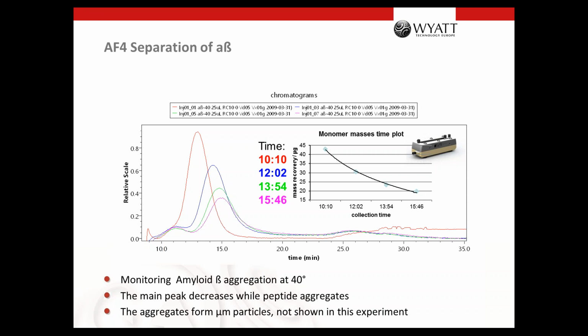And the more it is filled, the smaller the ratio gets, because the radius of gyration sees the particles inside too and gets smaller, while the hydrodynamic radius stays constant. This ratio can go down to 0.78. That is the ratio of a compact sphere, so that's the lowest possible value. And of course, another method would be, if you have a chromophoric group in it, to use the UV detector, which will also give you additional information.